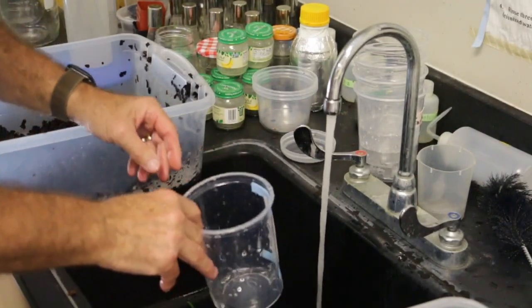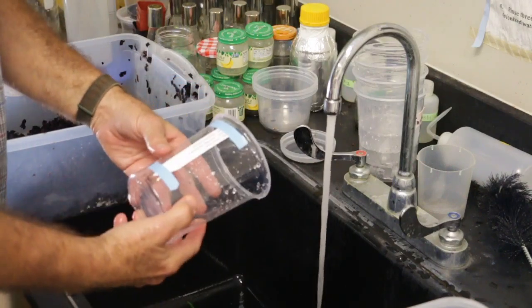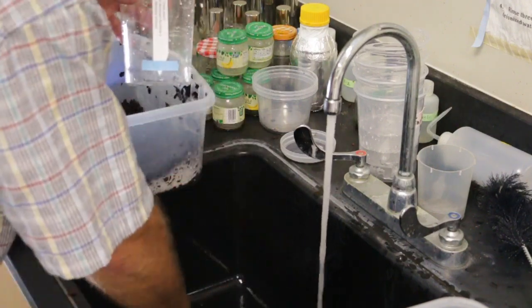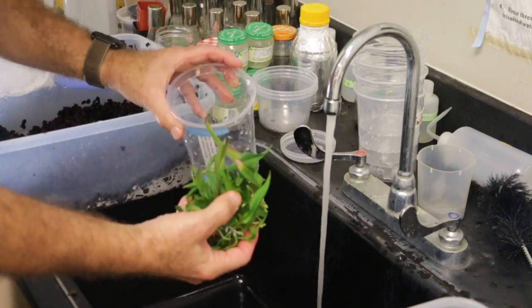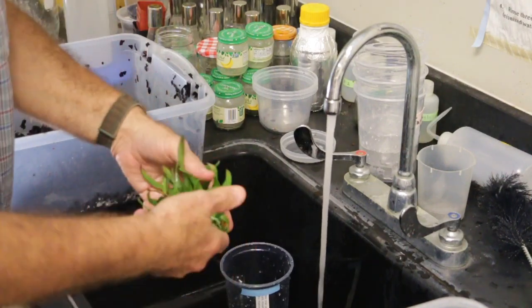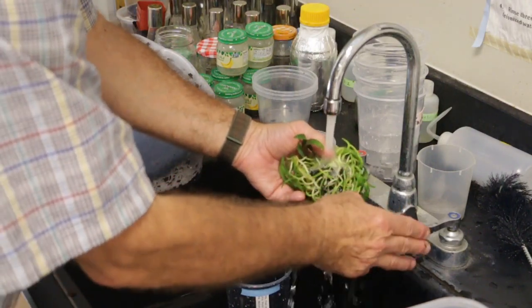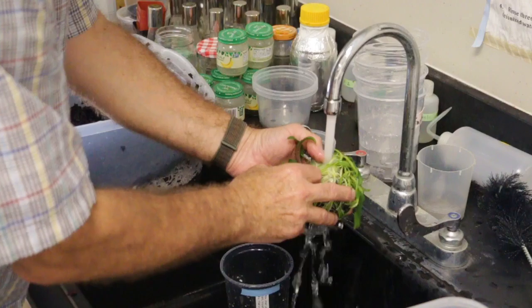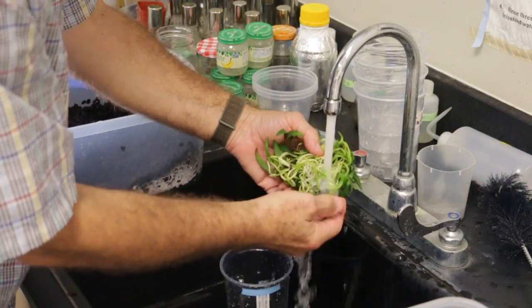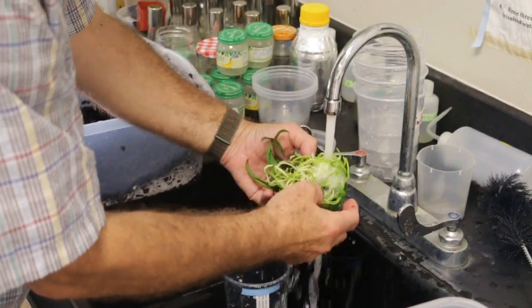Okay, so we're back, and what I like to do is rinse out the container here. Once I clean up the orchids and tease them apart, they're very delicate. They're right here, by the way, and I'll put them in this container in the sink just so they stay under very high humidity conditions, and they'll be in good shape. Then I get a little bit more lukewarm water, and I very delicately get rid of as much of the charcoal containing medium as I can.